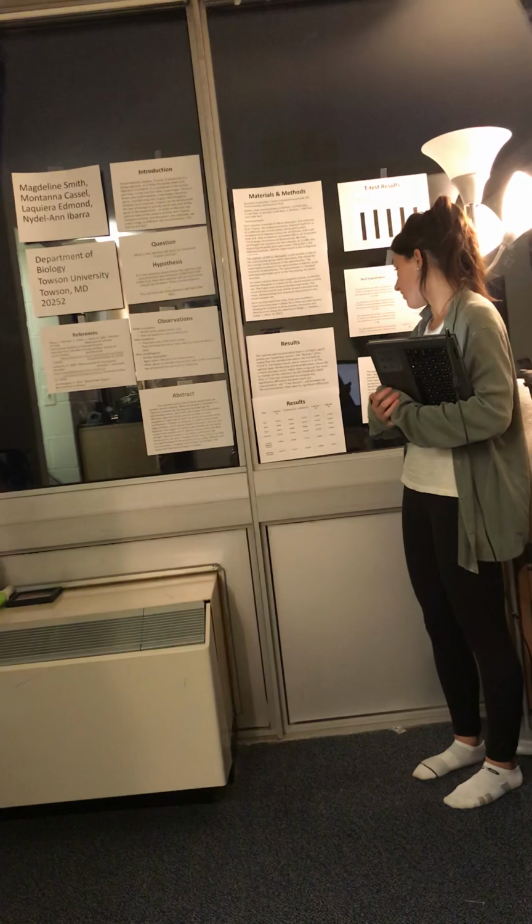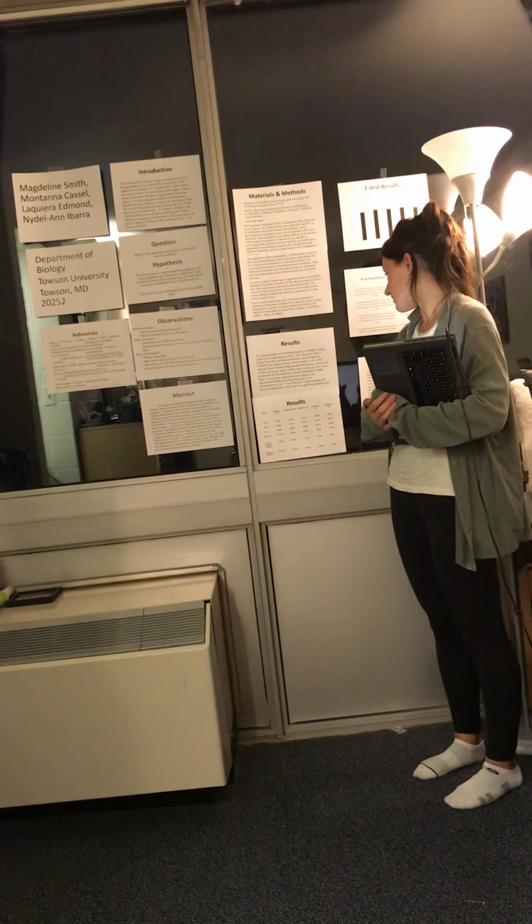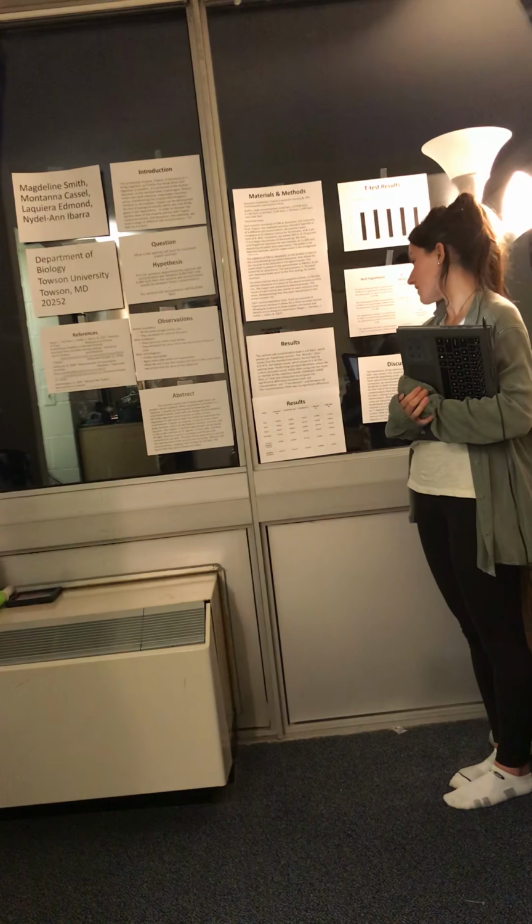0.3 moles of NaCl along with 0.6 moles of NaCl were slightly different compared to the other reactions, as both started out at a much lower reaction rate. The first trial for 0.3 moles was 0.595, and for 0.6 it was 0.570, and this can be a result of incorrect pipetting, contamination, not wearing gloves, not checking our machines, or putting something in for too long or at a wrong rate. It could be a number of things that my group would be more cautious with if we were to do this trial again.